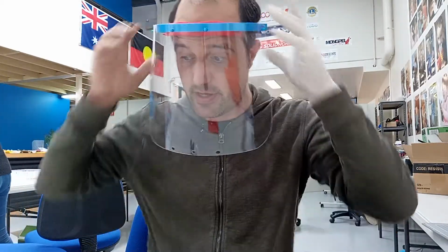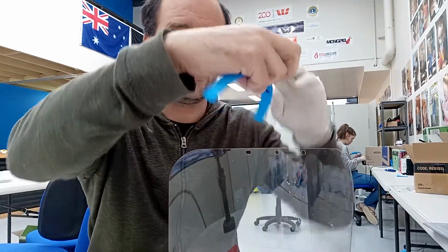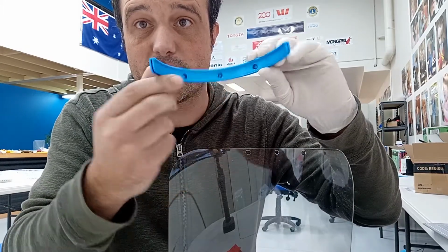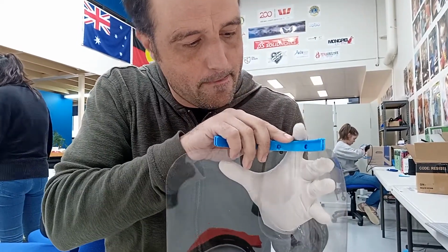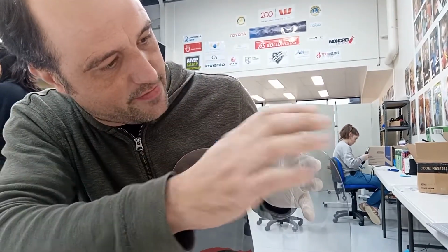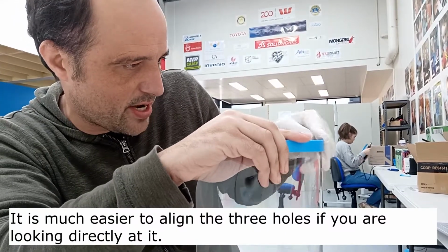And you can see now that the bottom is quite flat. We'd like that to curve around a little bit more. So that's what this bottom reinforcement's for. So turning it upside down, I'll actually turn it as if you're looking at it. This bottom reinforcement has got 3 holes in the bottom, so you actually curve the shield on and snap this into place. So lining it up, you need to line up these holes with the ones that are in the visor, and it should just go down into place. Sometimes it needs a little bit of a push, but once it's snapped in, it shouldn't come out.